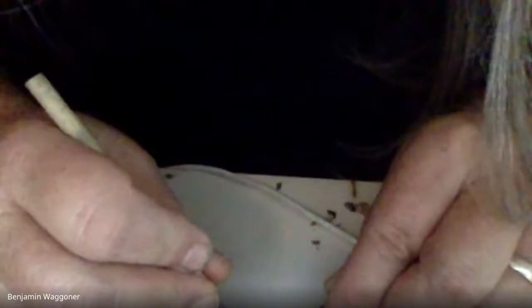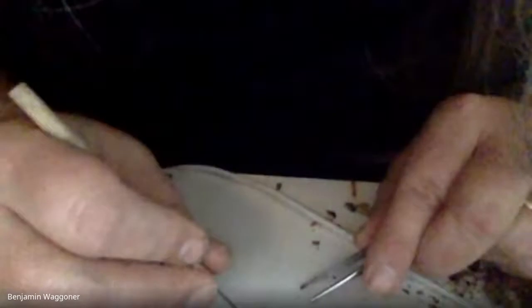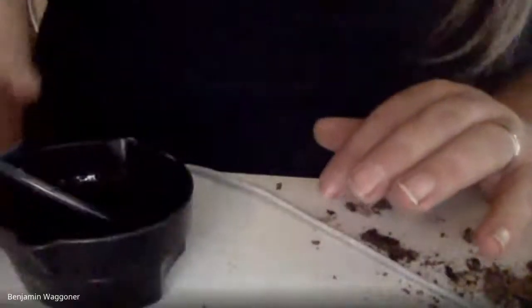Okay, so I'm going to kind of put a probe through the thorax and try to pull the abdomen, and there. I've just got all of the guts to come out in one piece. So that actually worked fairly well. Now, what we need to do is add some fluid, and if we were in regular lab, I would have saline.